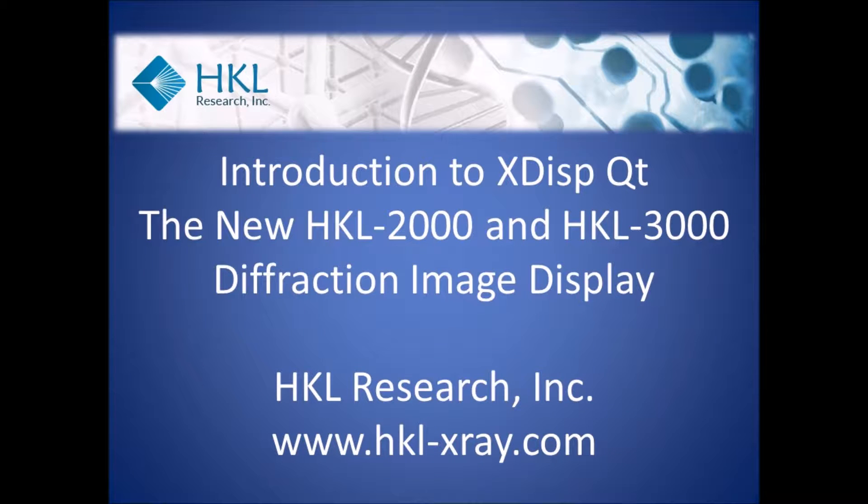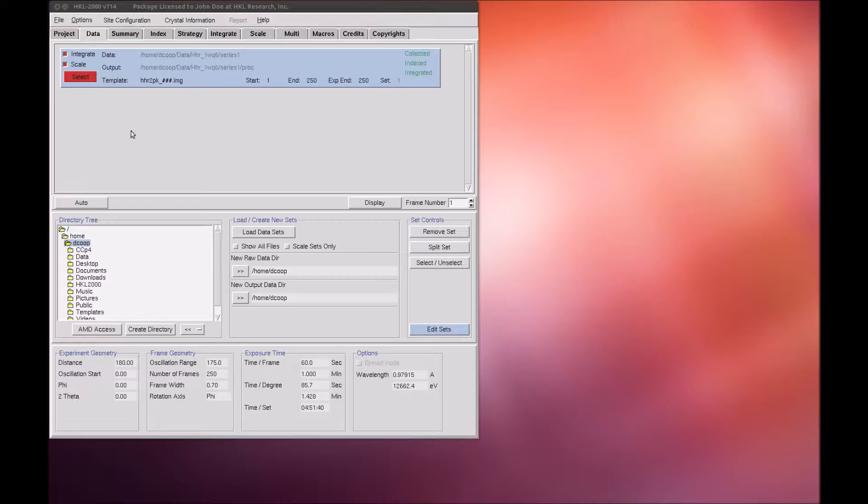HKL 2000 and HKL 3000 have a new, sleeker way of displaying your diffraction data because HKL is now distributed with XDISP-QT, the new version of the program that displays and interacts with diffraction images.